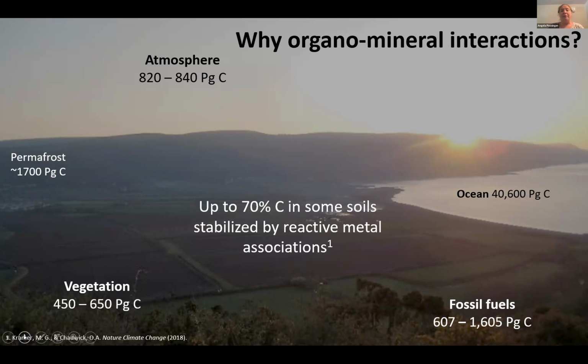And one of the more long-lasting pools of soil carbon is that associated with reactive metals. In some estimates, up to 70% of that carbon is associated with metal interactions. So this process of stabilization could be a potentially really important process that's conveying long-term persistence to carbon. And so these carbon reactive metal associations are our focus area for our imaging project.